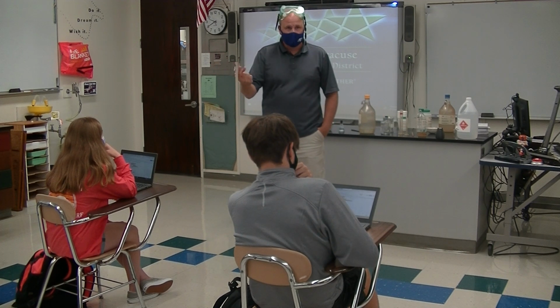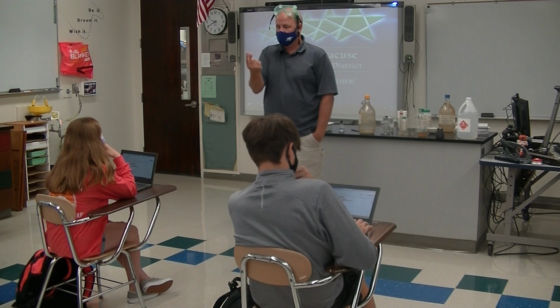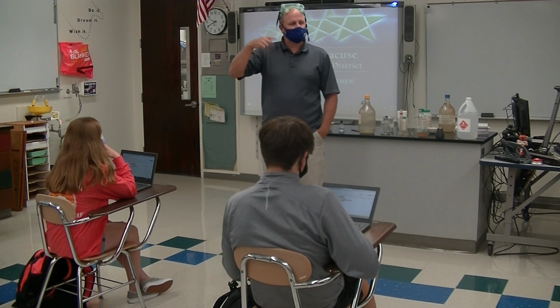Do your eyes have to be open or closed? Open. Have you ever tried to open your eyes when they're running water? It's not easy to do. How long do you have to rinse your eyes out for?